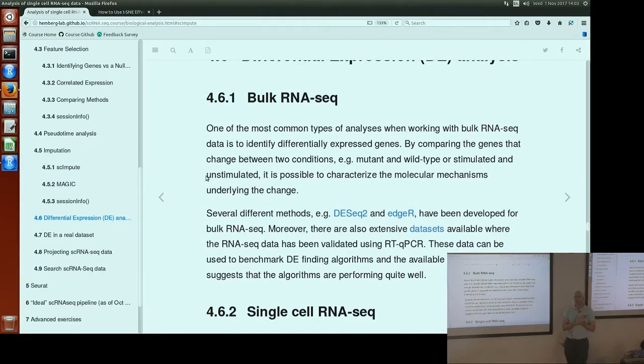The question is if these methods take the cell type into account. I don't think they do. I think they only look at the expression, because again, the idea is to use this prior to clustering, so they don't leverage that information.